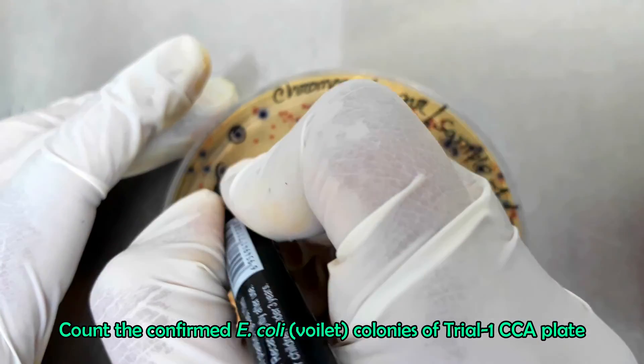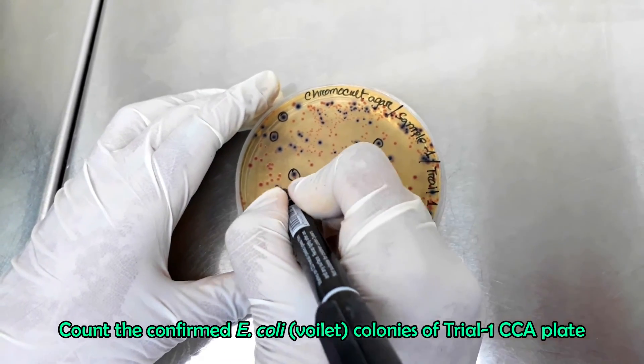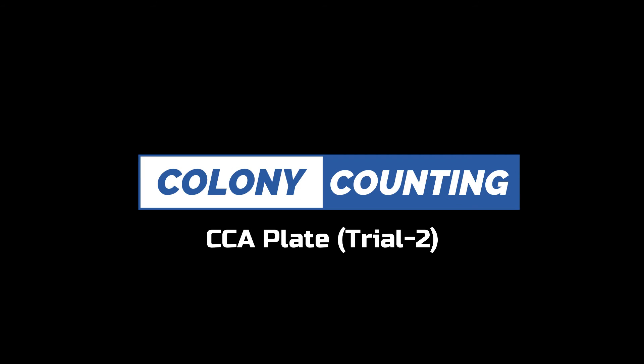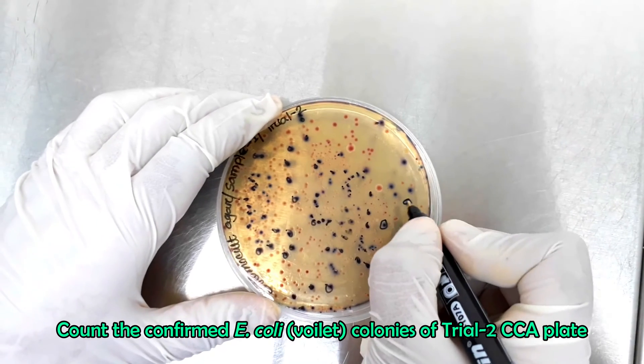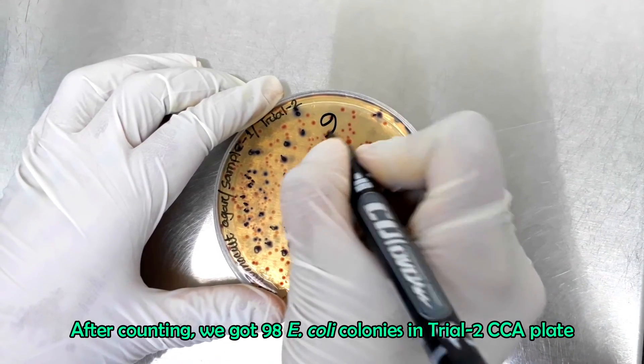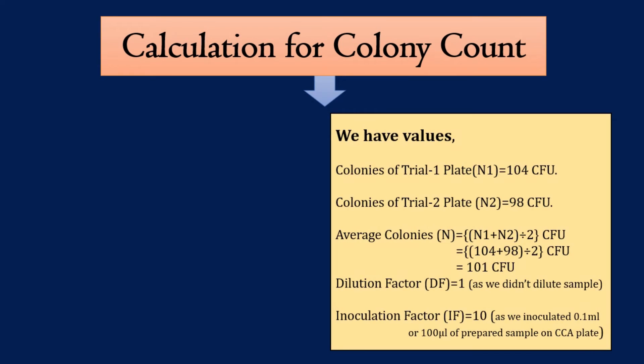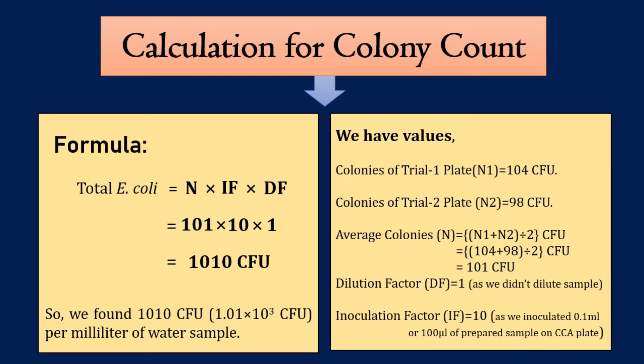Now we will count the confirmed E. coli colonies to evaluate the test result. In trial 1 CCA plate, we got 104 E. coli colonies. In trial 2 plate, we got 98 E. coli colonies. Now we have to calculate the total E. coli cells in the sample. We found 104 CFU E. coli in trial 1 and 98 CFU in trial 2. On average, we get 101 CFU E. coli. We did not dilute our sample, so the dilution factor is 1. We spread 0.1 ml sample on the CCA plate, so the inoculating factor is 10. Putting the values into the equation, the total E. coli count of the tested wastewater sample is 1010 CFU per ml.